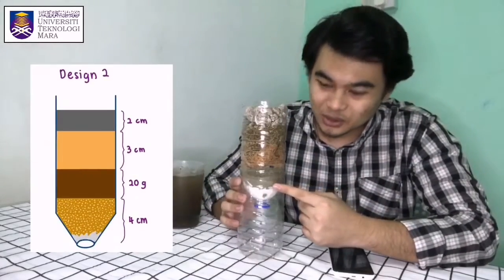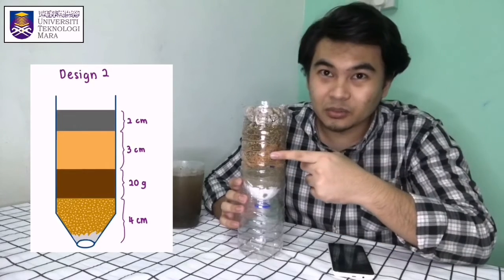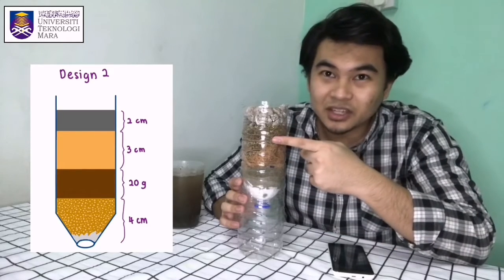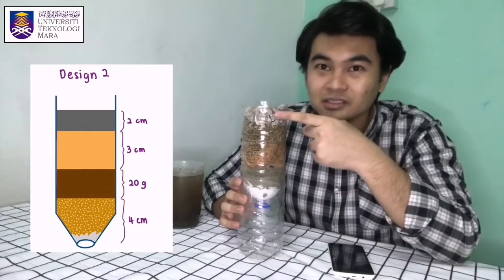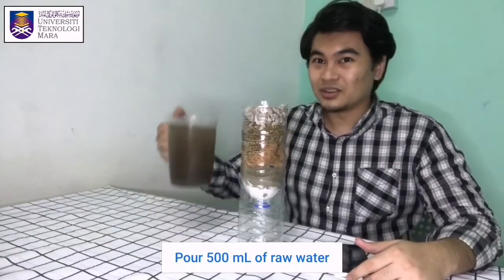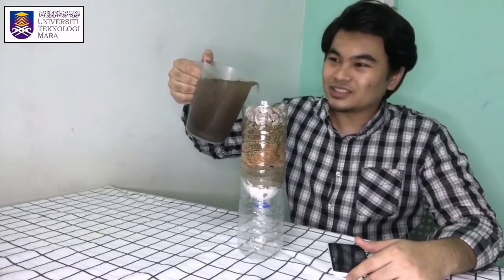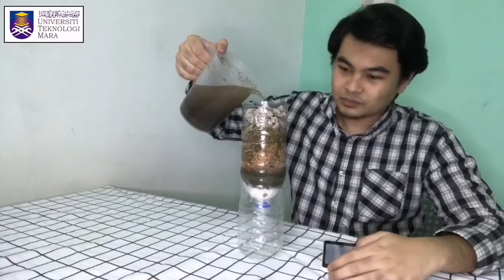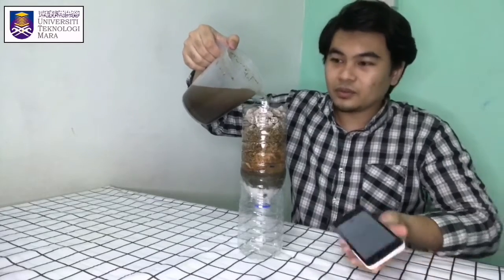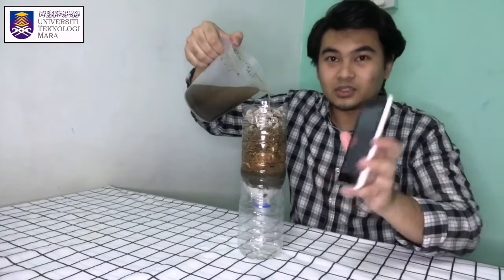First layer, tissue. Next, 4 cm of sand, 20 gram of coconut husk, 3 cm of fine gravel, and 2 cm of coarse gravel. Then we need to put our 500 ml of raw water. Let's pour. And start a timer using stopwatch.